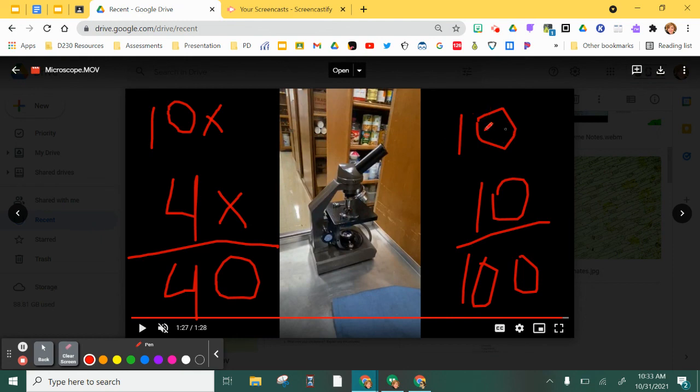The high power objective lens, again, eyepiece is 10x. Multiply it times what the objective is on the objective lens. You'll see a number with an x behind it. You'll be able to figure out how much that object has been blown up.